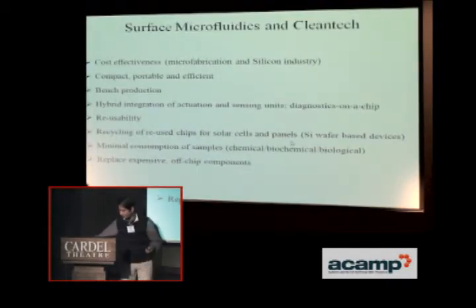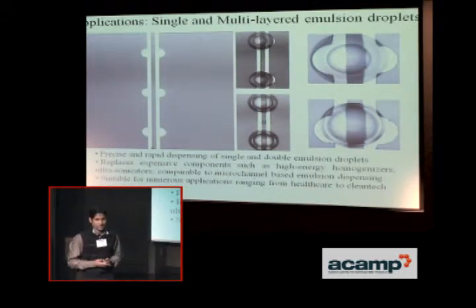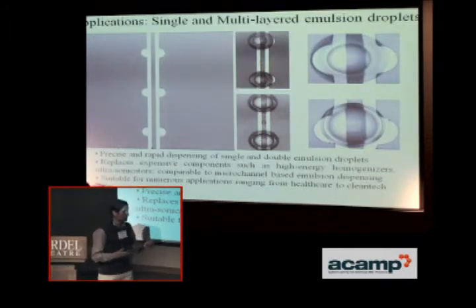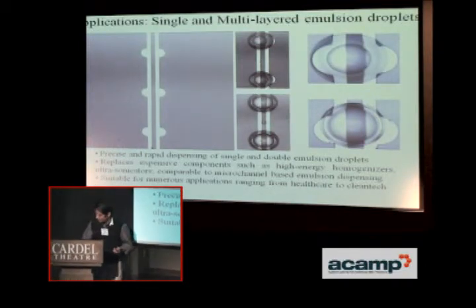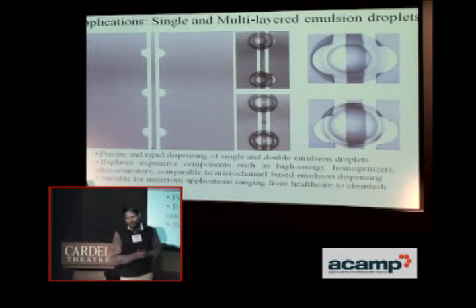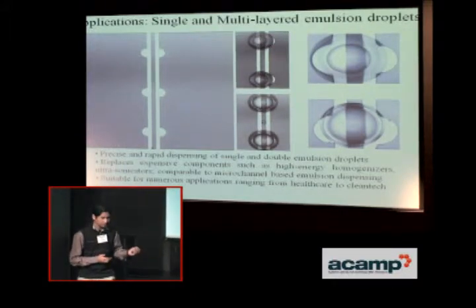Okay, anyway, moving forward. We have demonstrated biodiagnostic systems that can quantify biosamples in the range of a few femtograms. That is a very good precision of detection that we can offer, and it's comparable to the microchannel. It's better than the microchannel technology and comparable to the off-chip, macro detection schemes that are available.